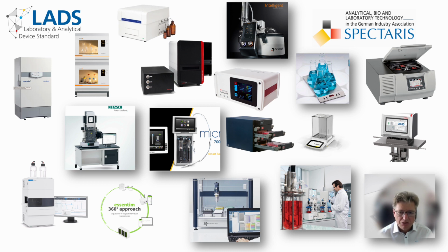There are many reasons to increase the level of automation. Better reproducibility of processes, improved data integrity, increased efficiencies, automation of tedious operations, and last but not least, the valuable and limited resource of human operators can be focused on higher value tasks. However, upon closer inspection, one realizes that most equipment was designed not with automation in mind, but for the manual operation by human operators. So we are faced with a challenging situation.